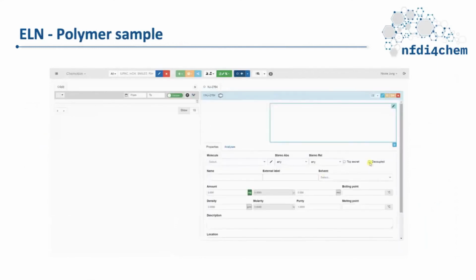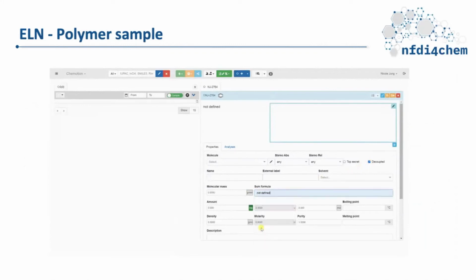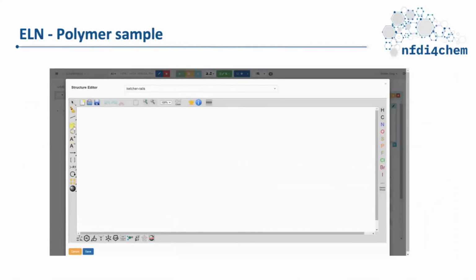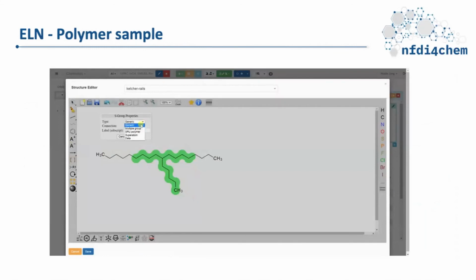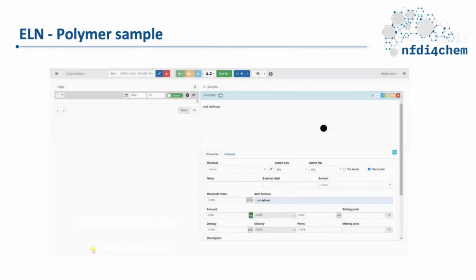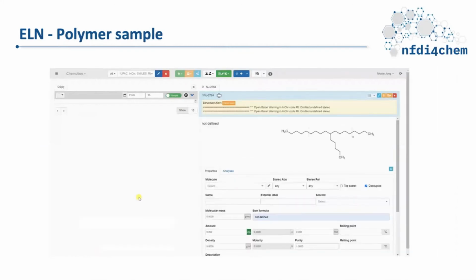So here is a real world example wherein the generic elements are used to generate a template, especially to fit the purposes of polymer chemistry. Here in the demo, you can see that the user is keying in the polymer, and then you can also see the different steps all along the way, how the metadata is captured and how the data is extended further.